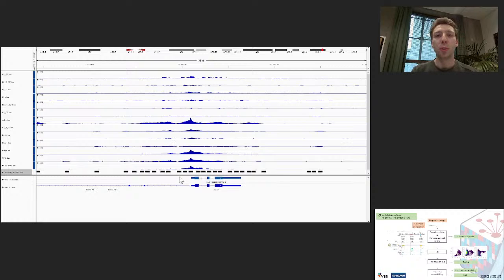We'll use these peaks as features to create a count matrix. What we'll do next is, for each cell barcode, not for each cell type, create a count matrix with the peaks as features and the cell barcodes as index, and then count the amount of reads per consensus peak.